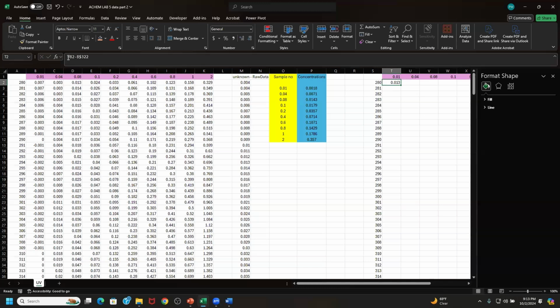So remember, in this equation, you click the first cell, then subtract the last cell, but make sure just in front of the number, not the column letter, you include the dollar sign, and press enter.